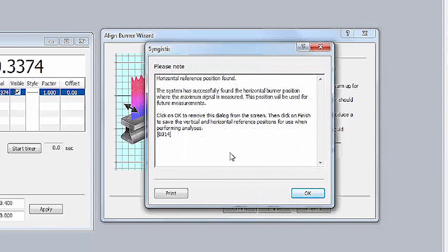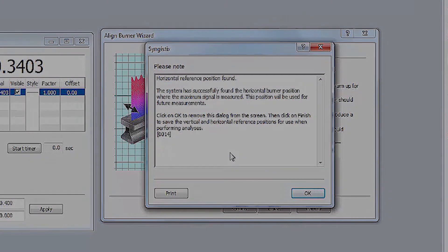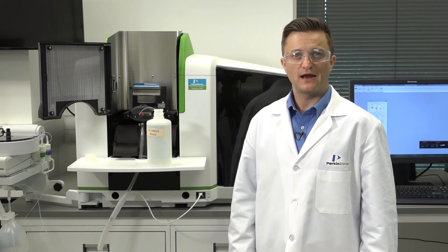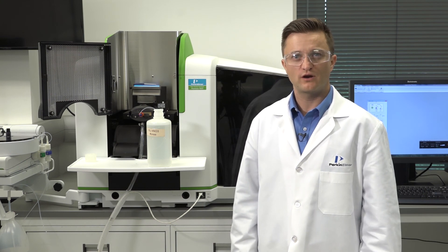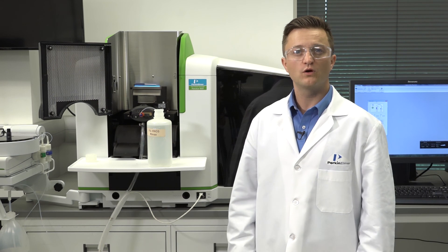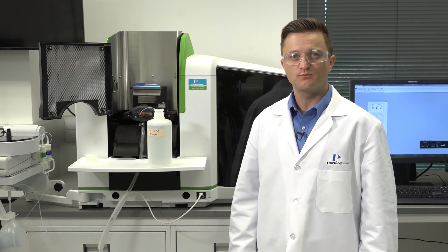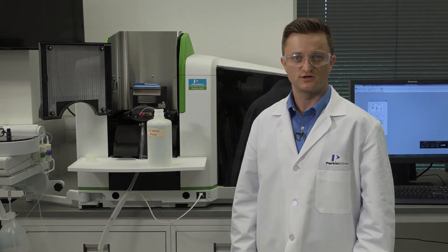Now your burner is aligned. After alignment, run a sensitivity check solution which produces approximately 0.2 absorbance units. Your instrument manual and these how-to videos are great resources to help get you familiar with your AA instrument. For more in-depth information on how to properly maintain and use your Pinnacle AA system, sign up for one of our training courses or contact your PerkinElmer representative for additional options.